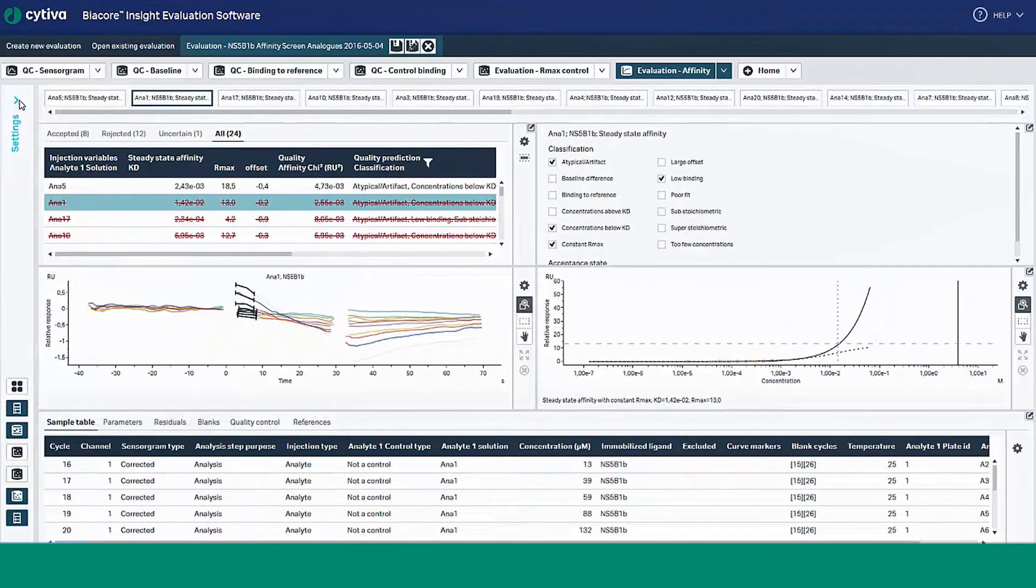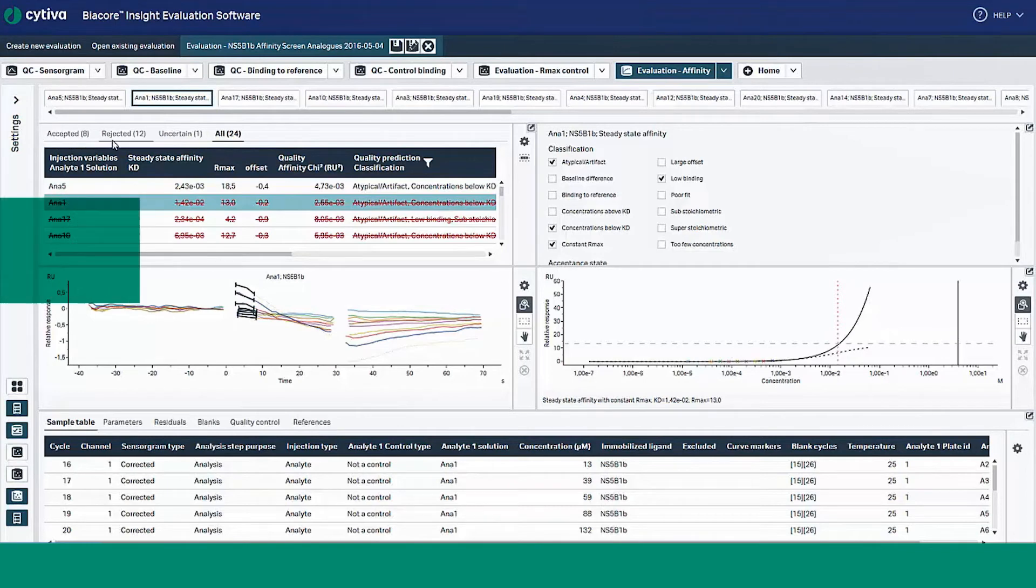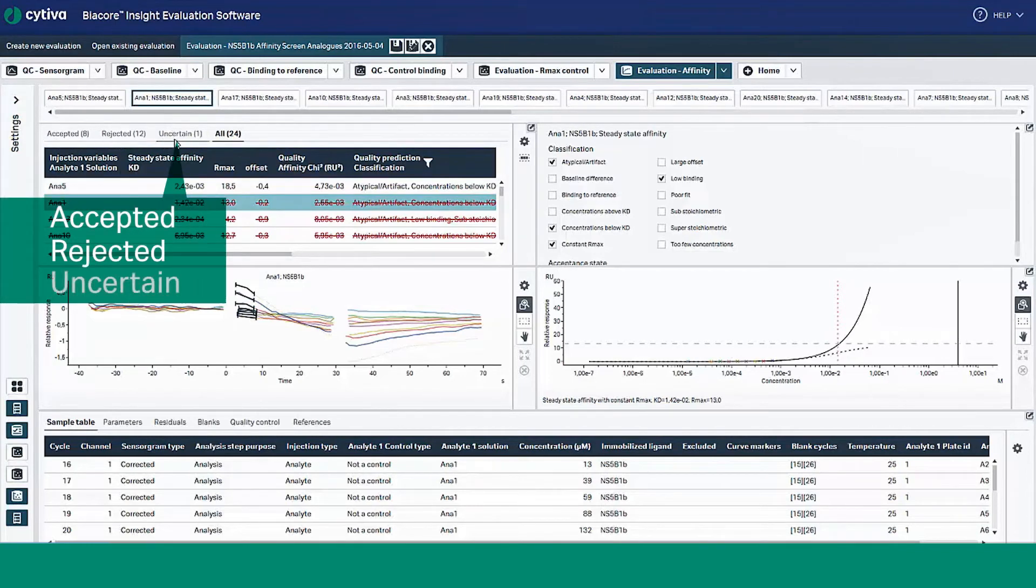Notice the prediction model automatically analyzes and assigns data into three acceptance states: accepted, rejected, or uncertain.